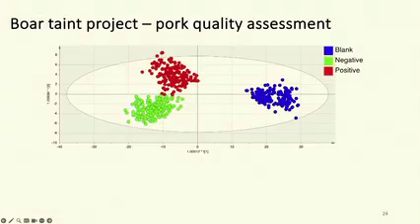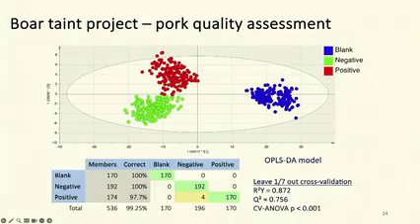It did allow us to quickly differentiate between different sample types. So the blanco, the samples contaminated with the smelly stuff, and the samples that were not contaminated. We also trained the data for the classification of new samples that are coming, and we really see a very high classification rate with the false negatives and false positives around 5% or less than 5%. So it's really like an industrially applicable quality control measurement.